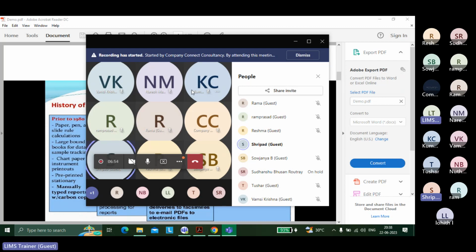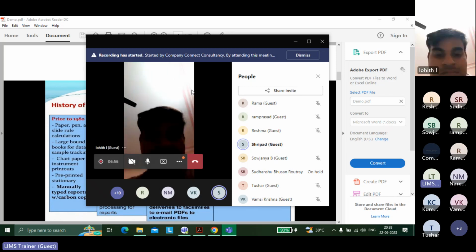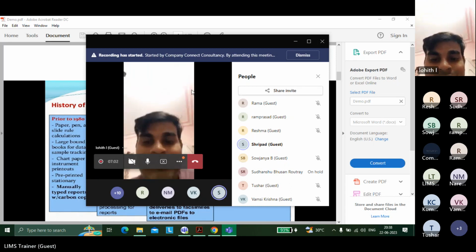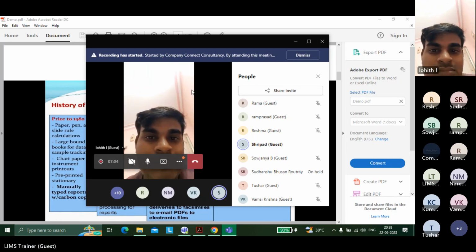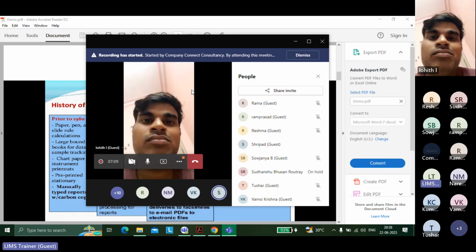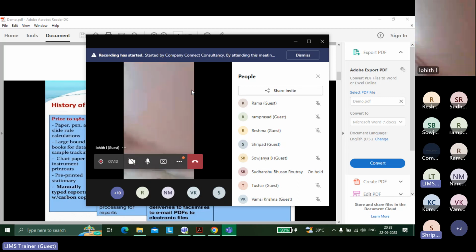So basically, it's a data management system. A laboratory information management system is a data management system that will easily create traceability for a particular analysis or test. Correct. Laboratory information means whatever happens in the laboratory, we manage everything using LIMS, right? That's another definition, to be very honest. But what you said is also possible in Caliber LIMS and other LIMS as well, because whenever you enter a result, it will get audited. Whenever you create a test, it will get audited. Who created it? Whenever you create a sample, it will get audited.